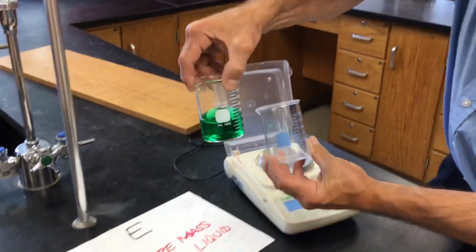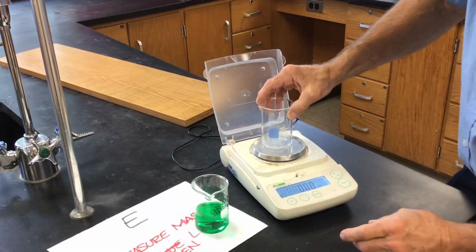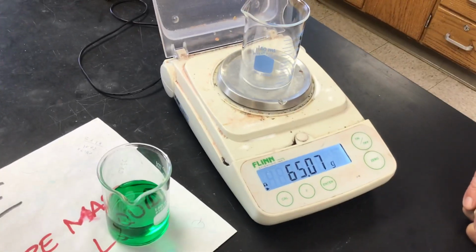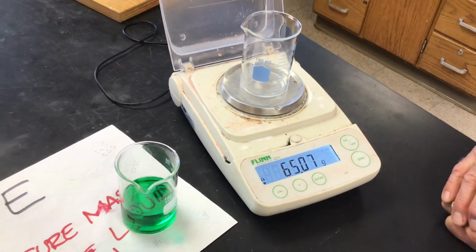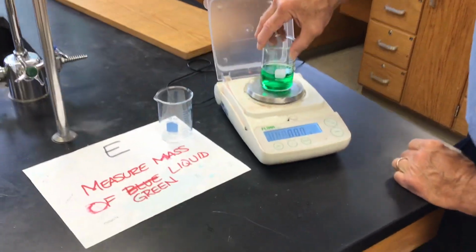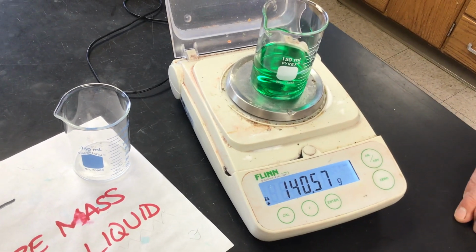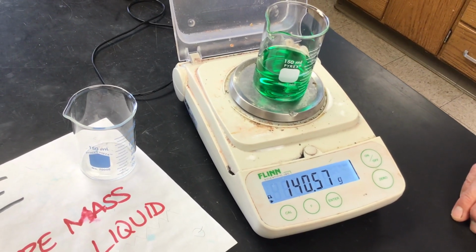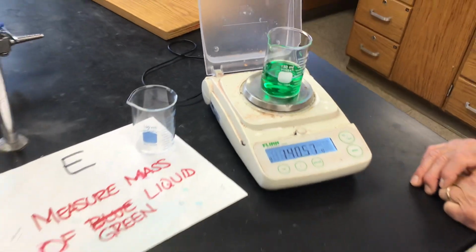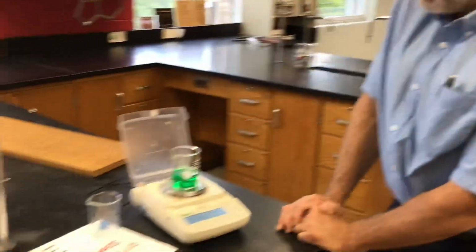I don't know. Are these beakers identical? I mean, could I do this? There's the mass of this empty beaker. Empty beaker is 65.07. I'll put the beaker with the fluid on. Okay, so with the fluid, that beaker is 140.57. Was that a legitimate way to get the mass of the liquid?